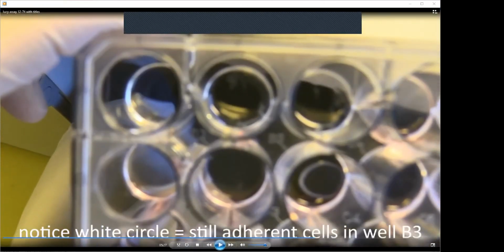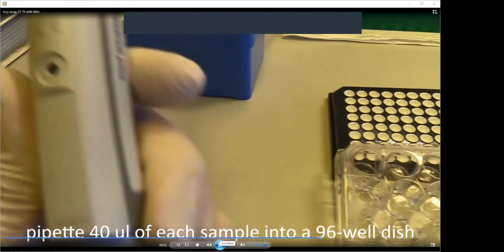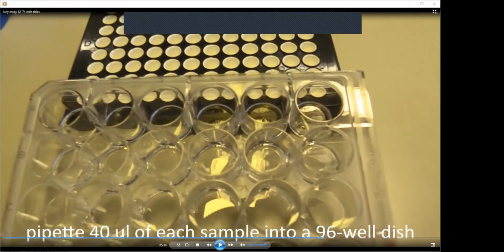And if you watch carefully, you will see that not all detached at this moment, because we have this white circle visible in this well B3, these are cells which are still attached. Here are cells which are not detached, so there are no cells actually, just this one. But in all other samples, it's already floating in the lysis buffer. So you always have to be careful and check this situation, because if you are mainly working with a new type of cells, it can be dangerous if you are not properly lysing them.